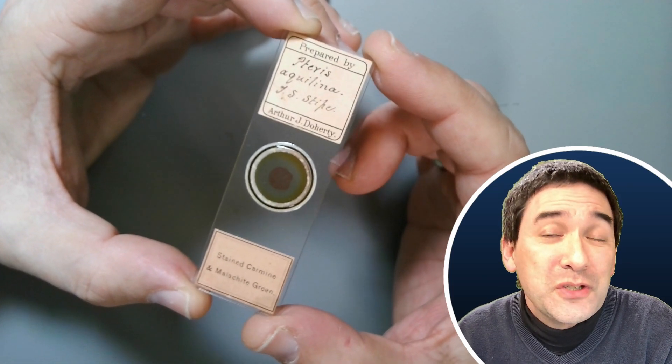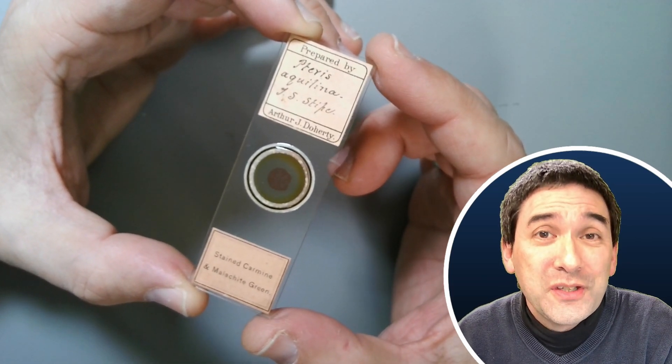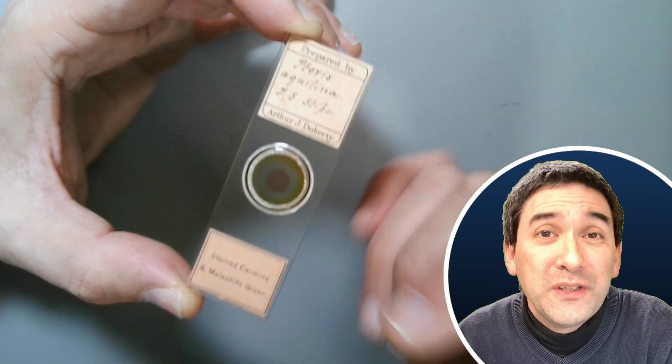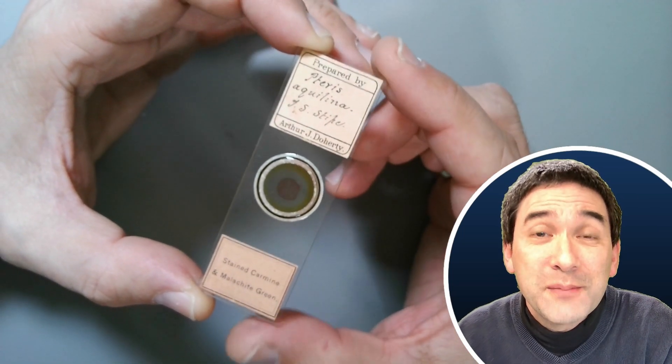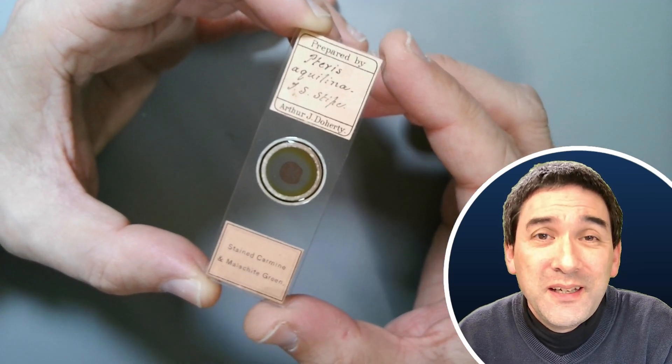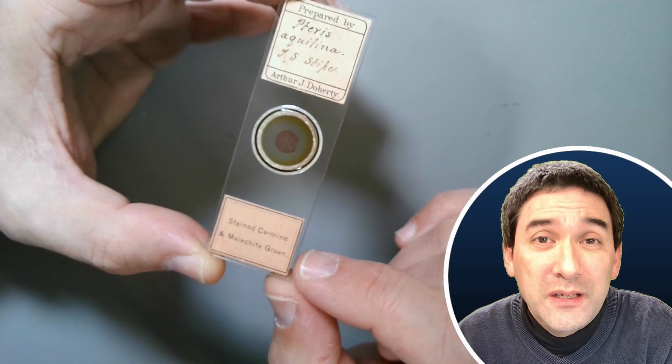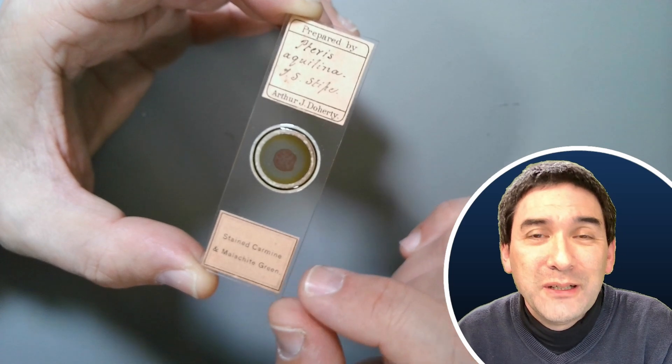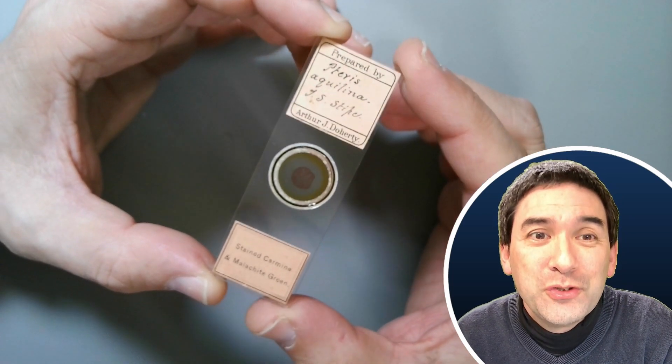And this slide in particular is quite pretty because of the so-called vascular tissue of the fern. These are the tissues of the cells that transport substances up and down the plant and look quite nice. The specimen was stained with carmine, that is a red pigment, and also malachite green. So we even have a little bit of information here about the preparation technique.